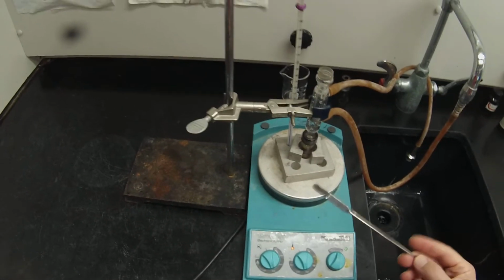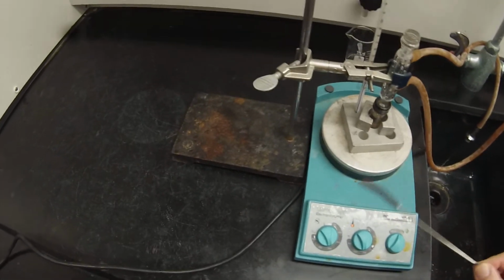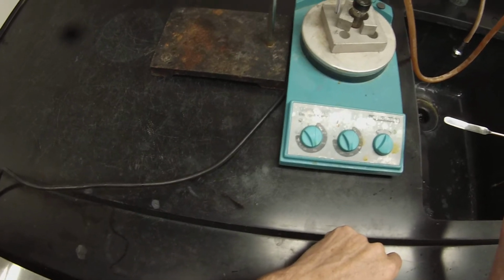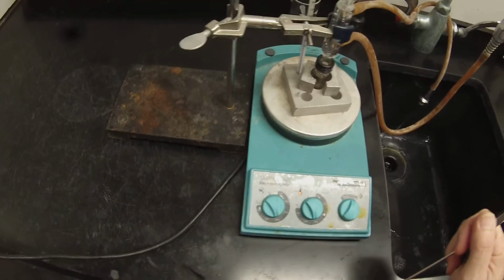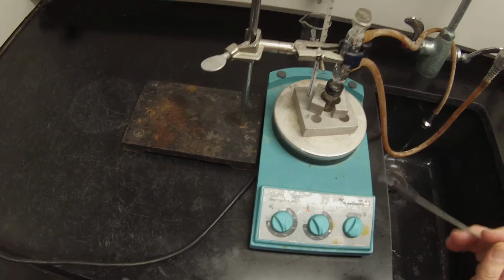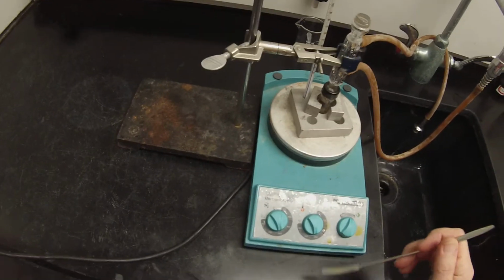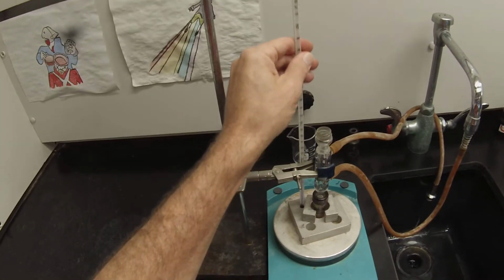Usually for a spin vane in a conical vial, I set it at about 600 on the stir plate. And if I'm doing a stir bar in the bottom of a round bottom flask, I set it at about 450. Those seem to be good settings. The temperature reading here is not going to be accurate for the temperature inside the vial. So it always has to be set a little higher than the temperature you're actually trying to achieve.